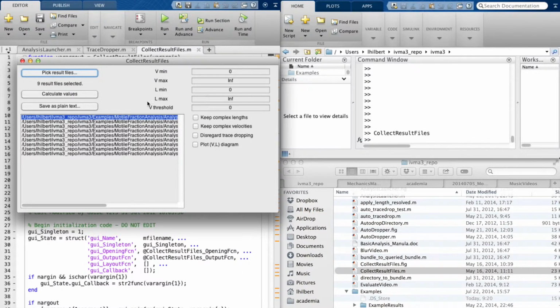And now what's new in here for determining the motile fraction is this V threshold, or threshold velocity, which we use to separate the instantaneous or frame-to-frame sliding velocities of actin into active motion above threshold, or into actin that is currently arrested below the sliding velocity threshold.